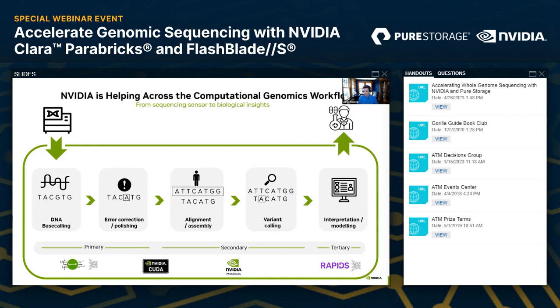And then finally, we have these reads that the sequencer outputs, which I mentioned before, long reads and short reads. There are different technologies there. Essentially, when you sequence a sample, so if you were to sequence someone's DNA, you're not able to do it all the way from the beginning to the end. It's 3 billion base pairs long. What the sequencer does is essentially read them in chopped up sections. So for short read, that could be 100 or 200 base pairs long, 100 A, C, T, and Gs. Or long read can be thousands or hundreds of thousands, but still nowhere close yet to 3 billion.